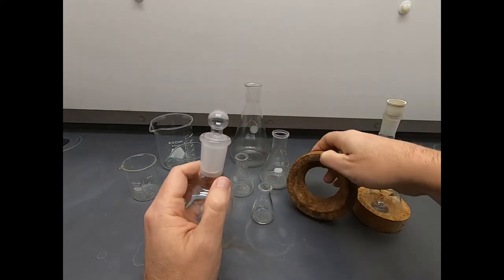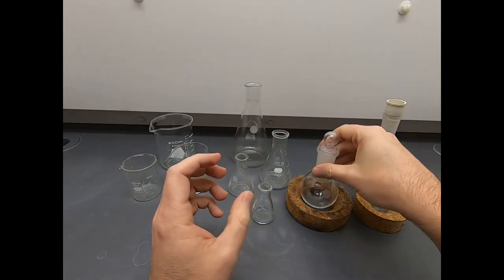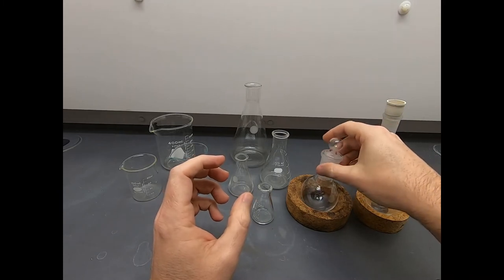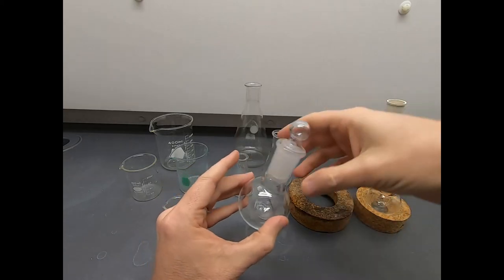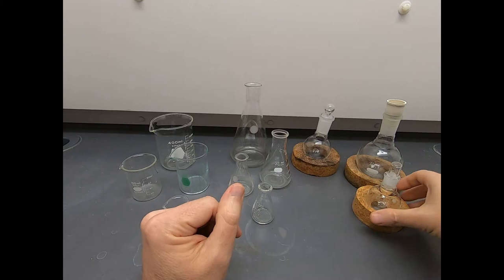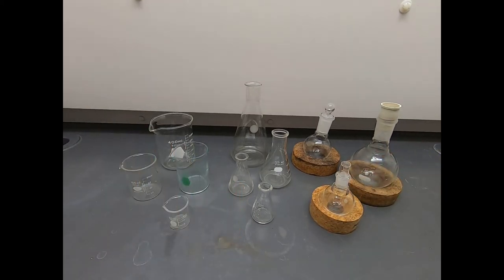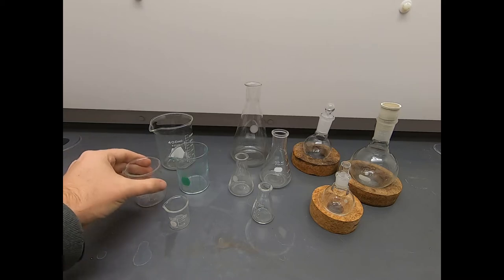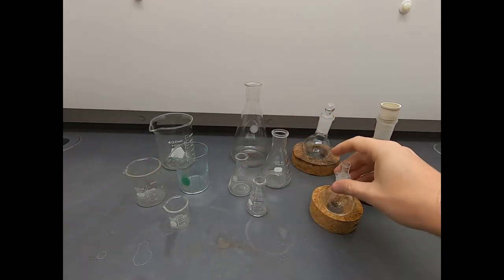Note that these cork circles typically have two sides, a top and a bottom, and the sides are typically different. One will be flat and one will be a little concave. The concave side lets you accommodate a different flask size from the other side. This is a 100 milliliter round bottom flask. If we turn it over to get a narrower hole, that one works well. So there's some flexibility in how these cork circles are designed. These are the core workforce glassware that you'll encounter in a laboratory. These are what I consider the containers.